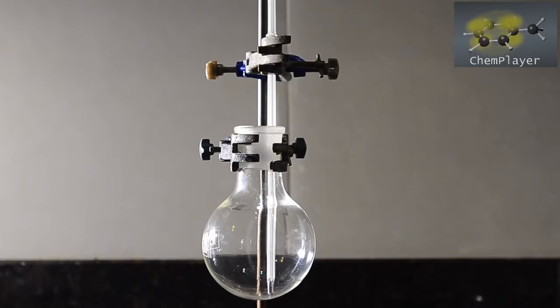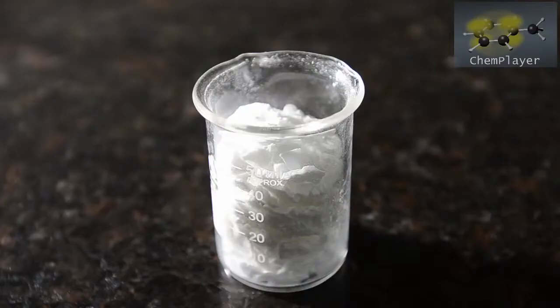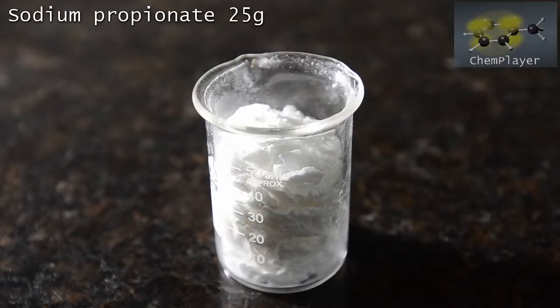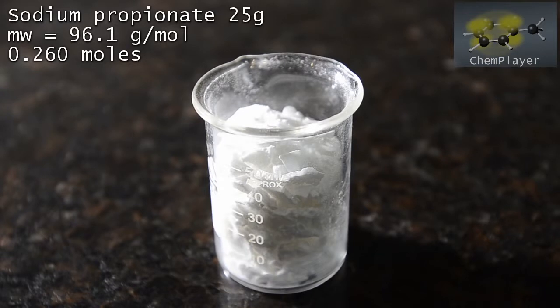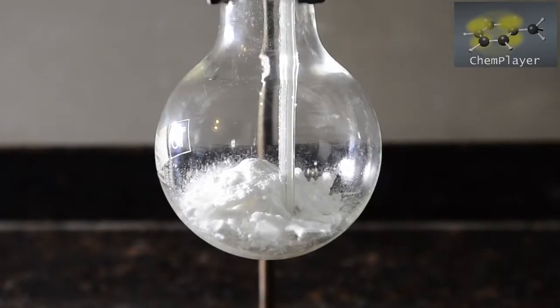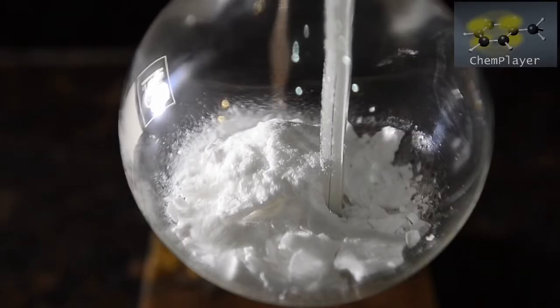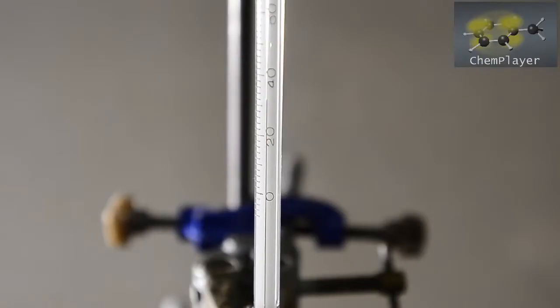We've set up the 250 ml flask with a thermometer. And here's 25 grams of the same sodium propionate we used for the previous experiment. We used the same batch because we wanted to check that this is good quality. Okay, we've got this into the flask. The thermometer is here because, as in the previous reaction, we want to demonstrate how much heat is generated by the reaction. We're starting at just over 30 degrees C.